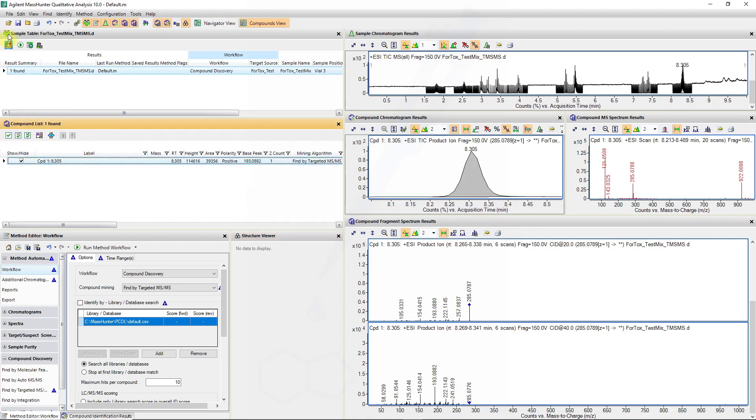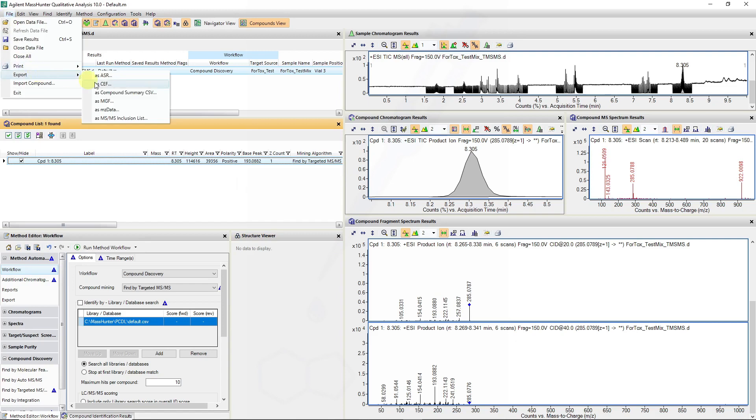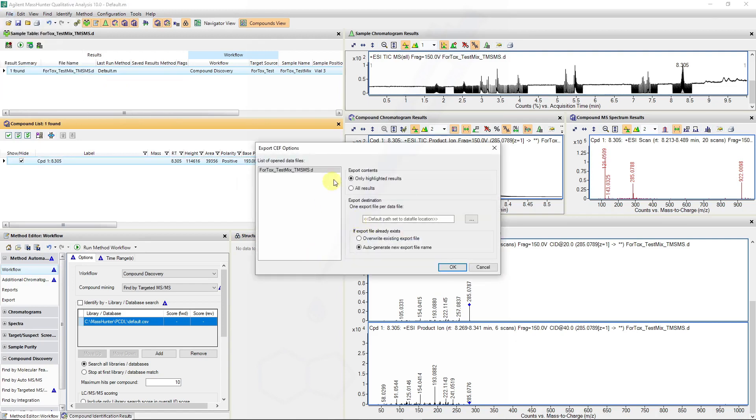We will now export this data as a CEF file. Exporting it as a CEF file creates a CEF file of whatever you've highlighted in this table, and it will place it in the same directory as the data file.